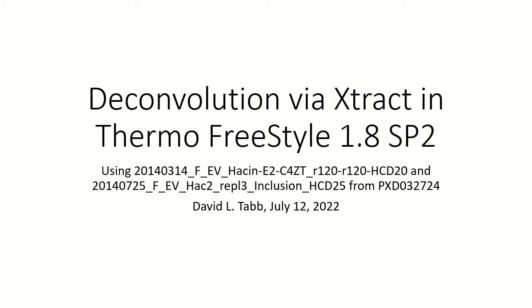Hello, this is Dave Tabb, and today I would like to talk to you about how to do deconvolution. I've been doing a lot of courses, as you know, on how to do top-down identification, and the topic of deconvolution is certainly one that shows up almost every time top-down identification is mentioned.